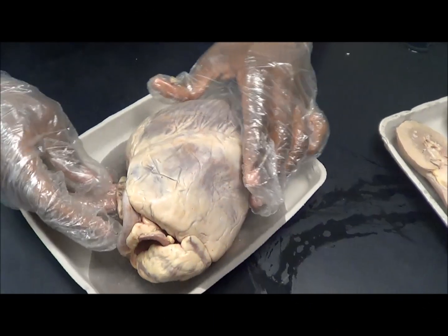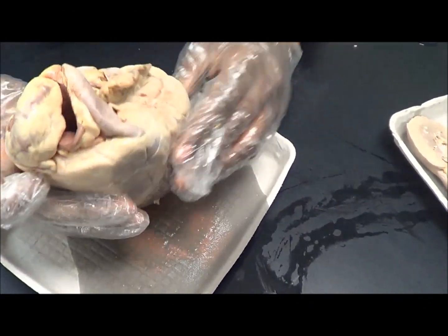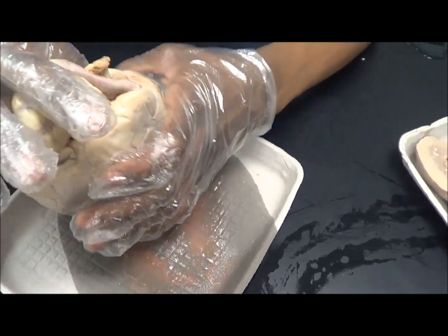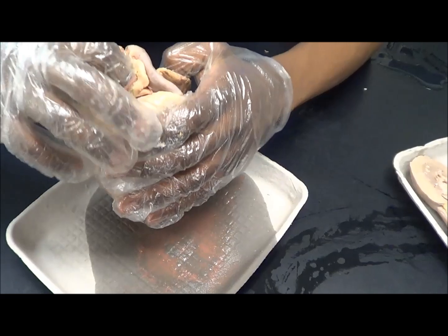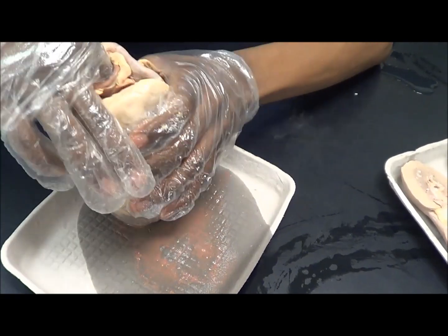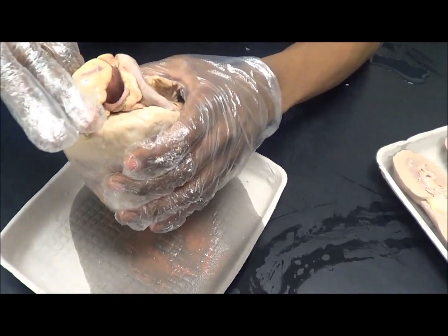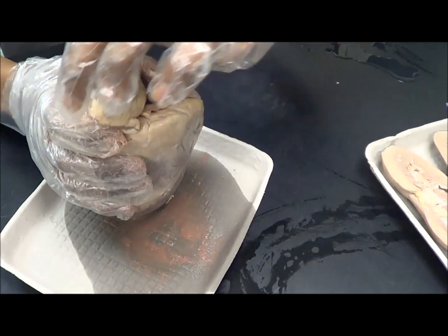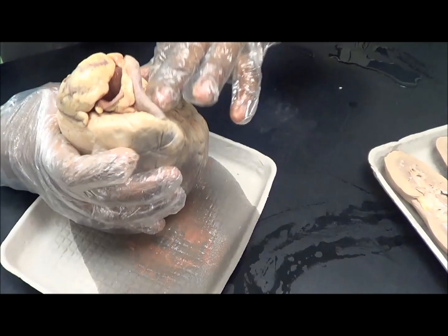I'll be doing the heart. Before you start, you can play around with the heart and finger it in between these aortic semilunar valves, and if you finger it good enough, you'll find these chambers and tunnels where it pumps the blood in and out.